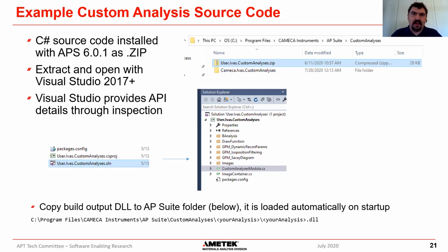The examples are simple, and they provide some good examples of how to use things. So unfortunately, we do not have, at the moment, a documentation package for our API for these modules. Again, if we waited till that was ready, we'd never ship. So we've provided these examples instead.